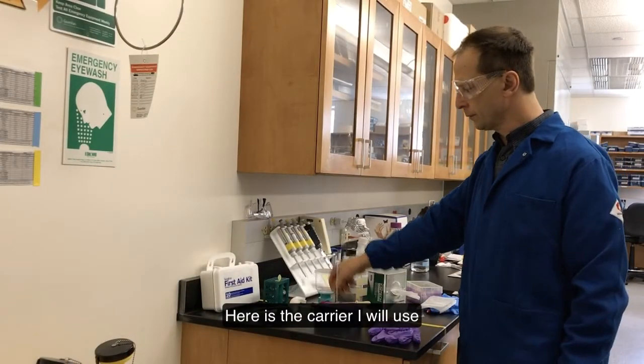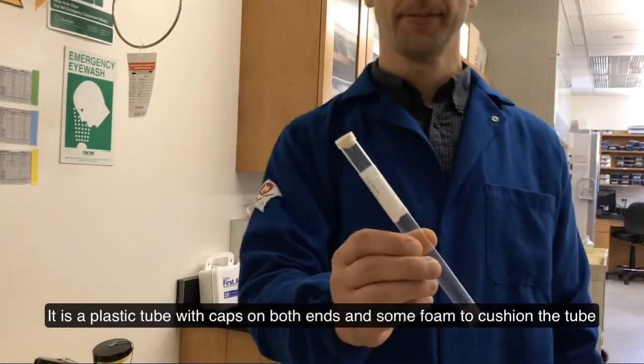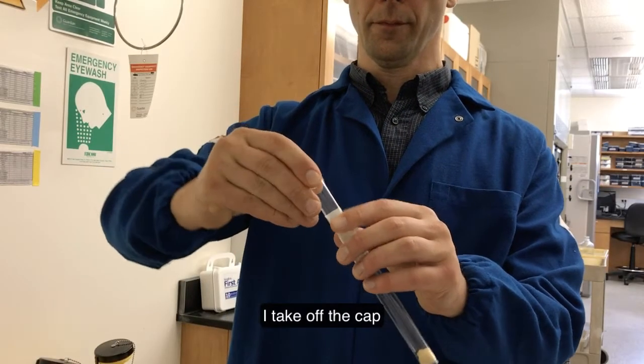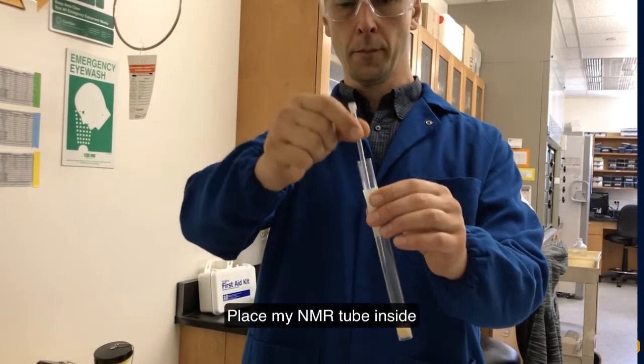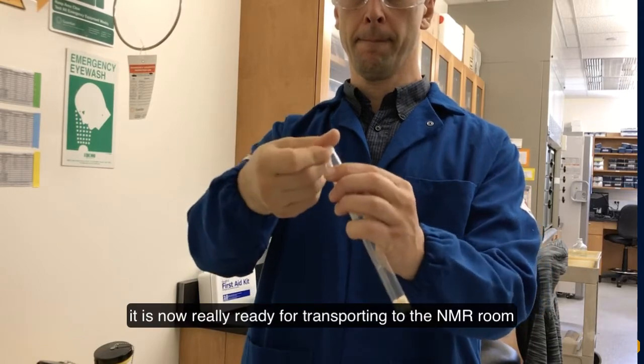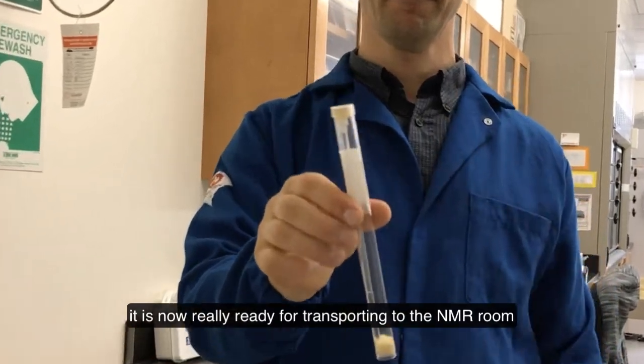You may purchase inexpensive NMR tube carriers like these, or use a homemade one, as long as it securely closes the tube during transport. Here is the carrier I will use — it is a plastic tube with a cap on both ends and some foam to cushion the tube. I take off the cap, place my NMR tube inside, close it, and it is now ready for transporting to the NMR room.